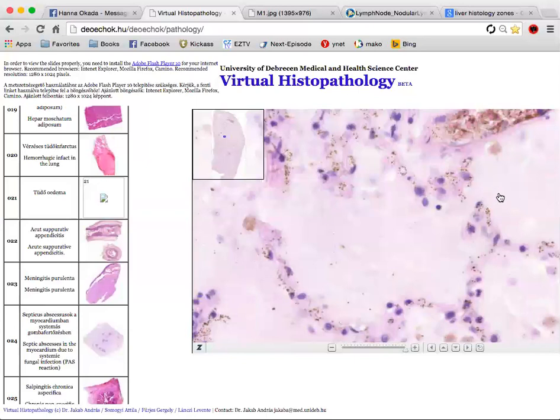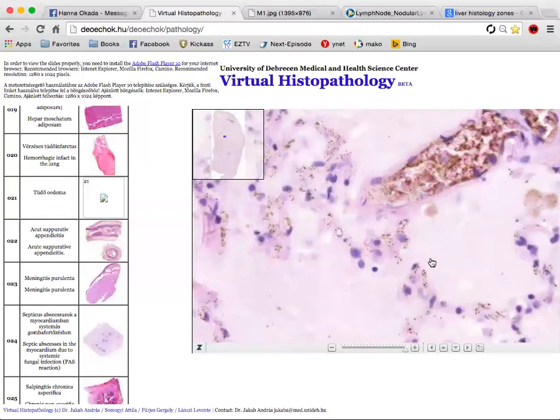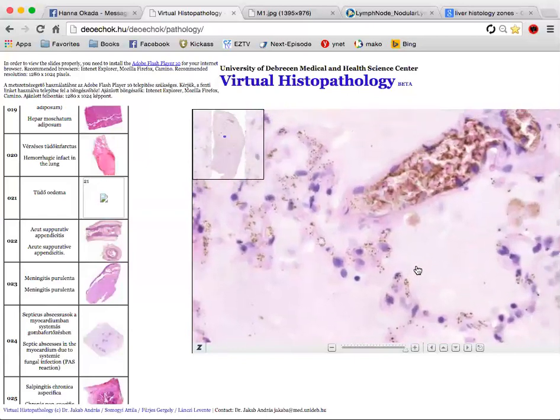The difference from the normal tissue in this slide is this lighter area filled with fluid. Yeah, because this would be clear. This would normally have air.